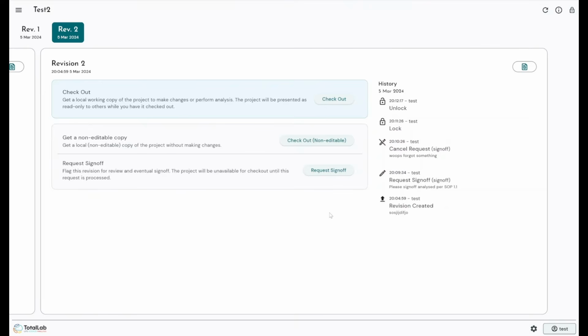So that would be a whistle-stop tour of how analysts would use the client side of the software on a day-to-day basis to perform their analysis and have their full audit trail with electronic signatures accompanying it. Again, a very quick run through of all of the options that are available to you within the AuditSafe software to generate data and analysis reports that are compliant with 21 CFR and GMP regulations, and all of the guards that we've put in place to make this software as secure and to make your audit trail as rigorous and secure as possible.